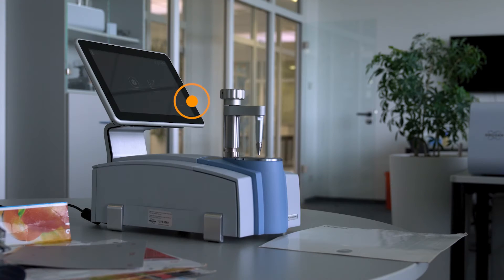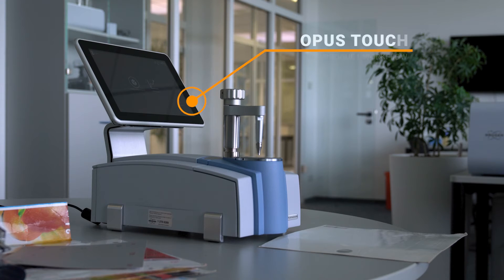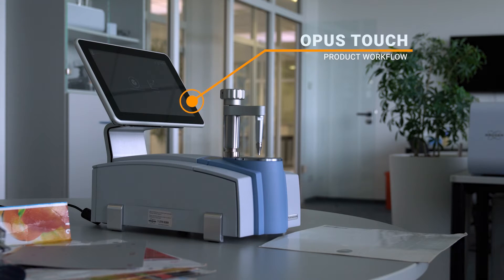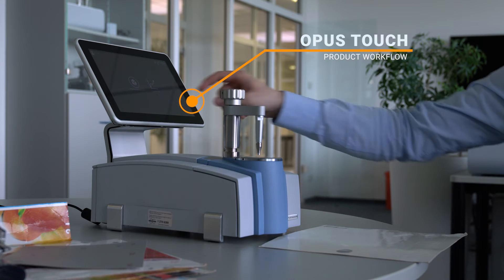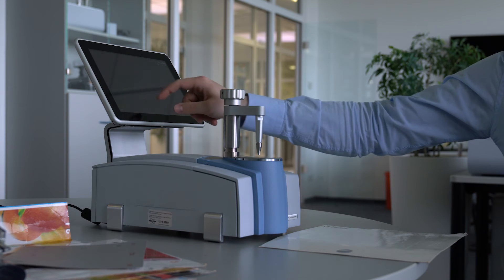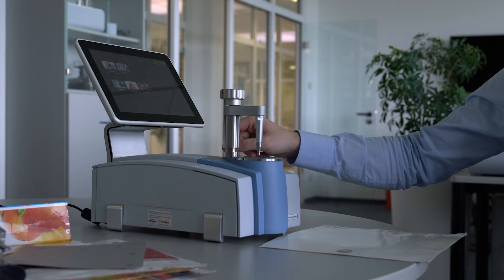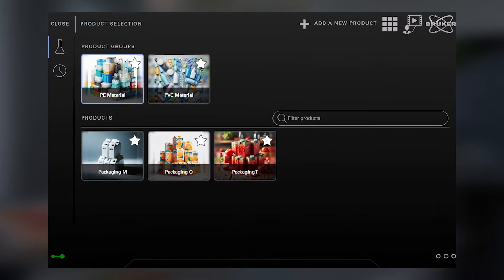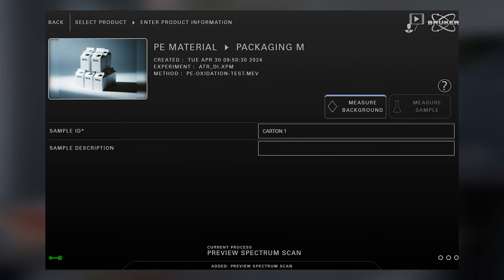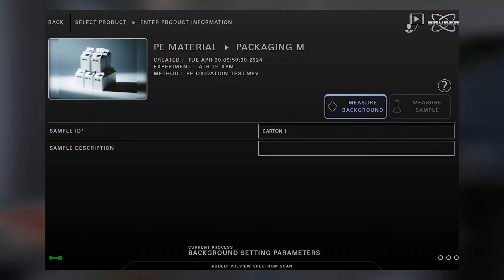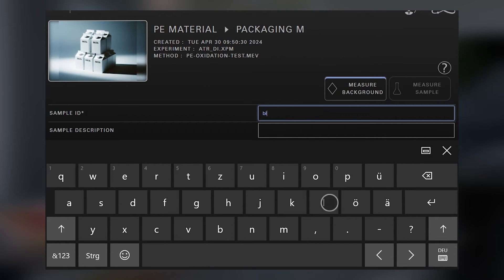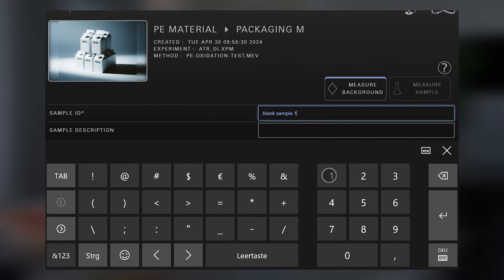The necessary spectroscopic know-how is contained in Opus Touch, which combines all analytical steps into a push-button product workflow. First, the appropriate product is selected, in our case PE material on a milk carton.